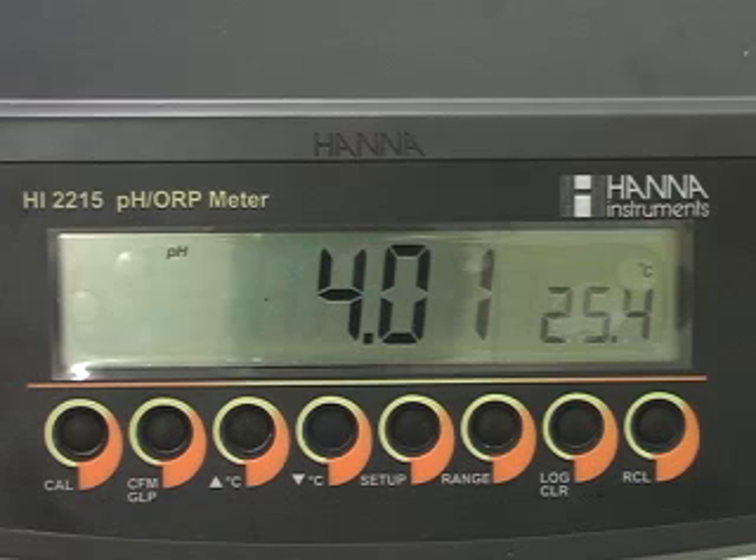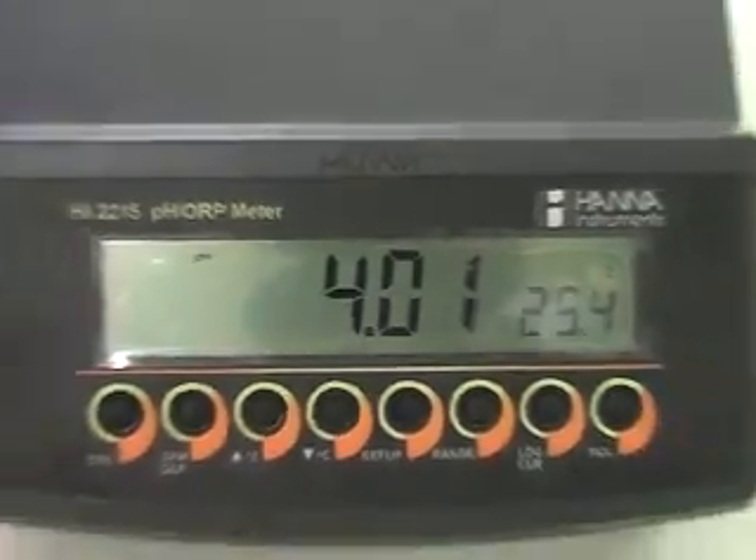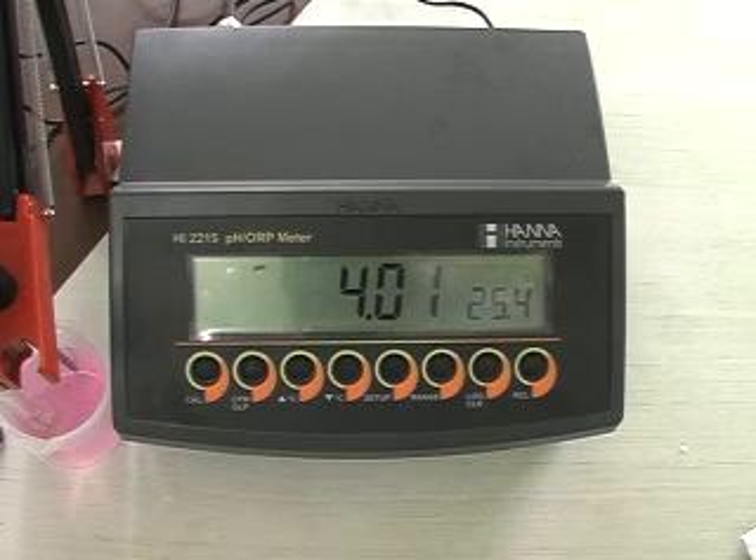So, this is the normal 2-point calibration for HI2215. You can calibrate your meter regularly for better accuracy. The instrument should be recalibrated whenever the pH electrode is replaced, at least once a week, at the time of testing aggressive chemicals, or when your instrument starts showing calibration due. In these 4 cases, you can calibrate your meter. This is a small demonstration of HI2215. Thank you.